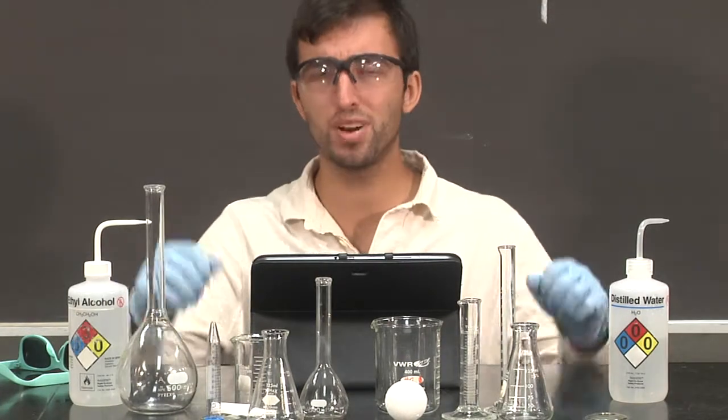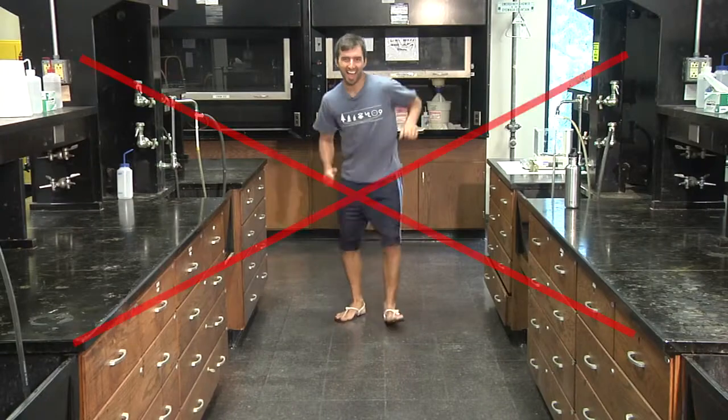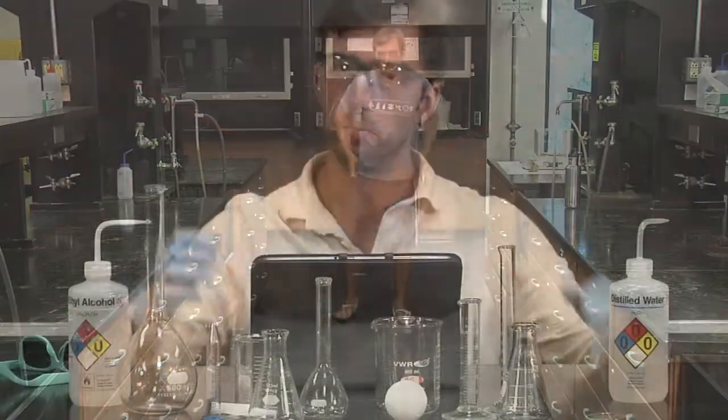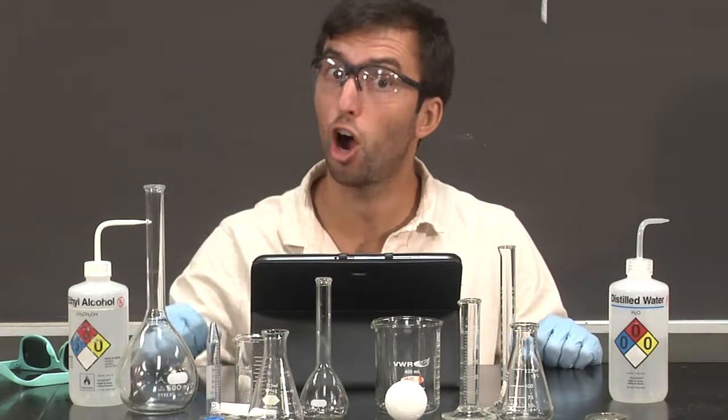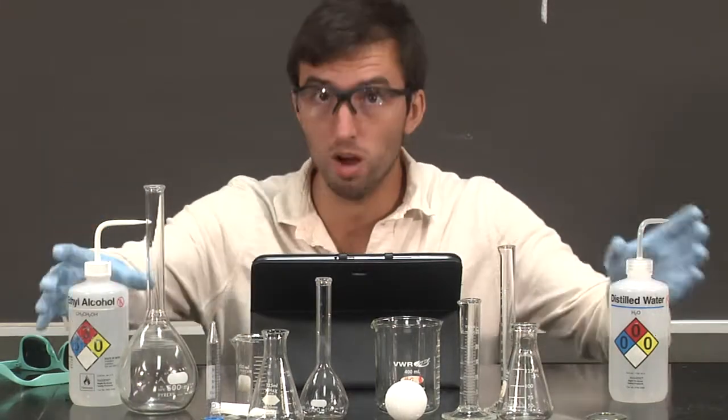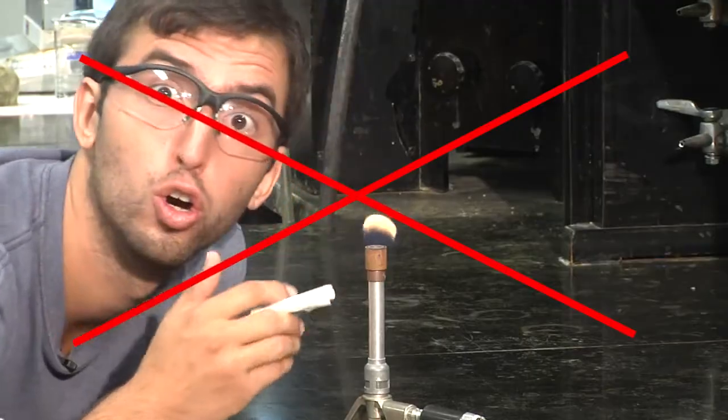Appropriate clothing must be worn to all labs. This includes closed-toed shoes and pants. Bunsen burners require caution. Good housekeeping promotes safety. Clean up your lab bench as you go. Eating, drinking, and smoking are not allowed in the lab.